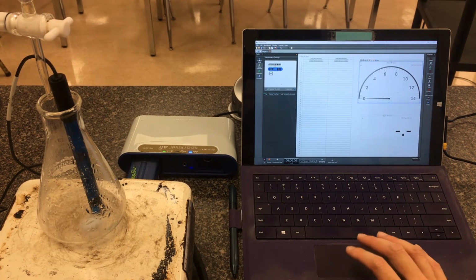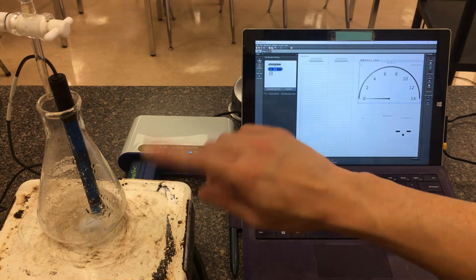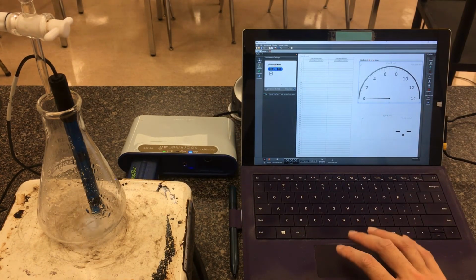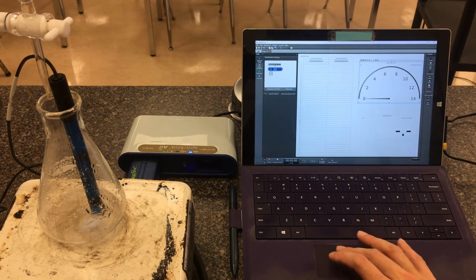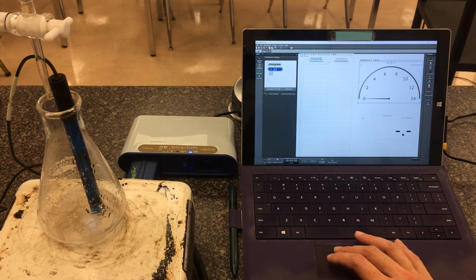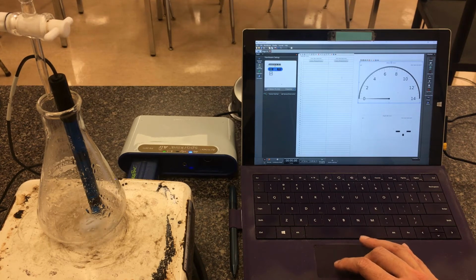So what I have here again, our meter is hooked up to our SPARKlink Air. It's connected via Bluetooth to my computer here. I already have Capstone all set up here. So our hardware is our SPARKlink Air. It knows that in port 1 there's a pH sensor. Previously, this was plotted in real time. It was really convenient here. It plotted the time versus the pH.